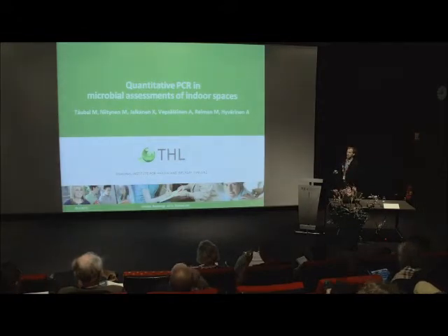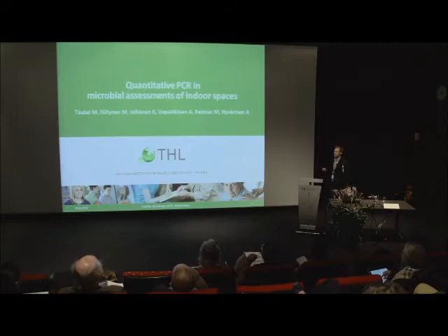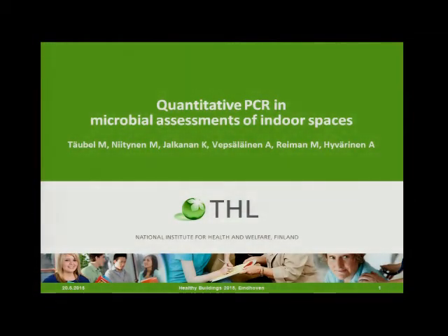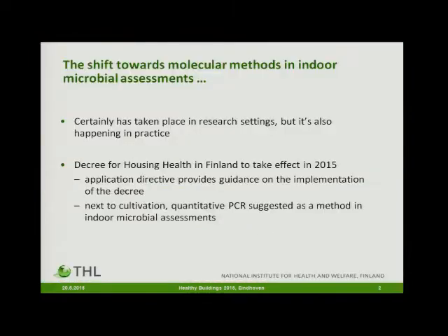I'm going to pick up the ball that Anne dropped this morning with development or providing guidance on how to use qPCR in practical situations for practitioners, and tell a little bit about the work that we've been doing in a way to make this method now available to practitioners, really to go into buildings and measure microbial contamination also with quantitative PCR.